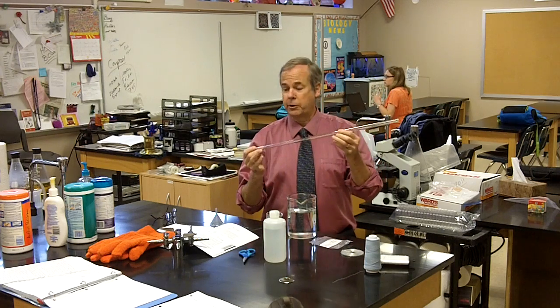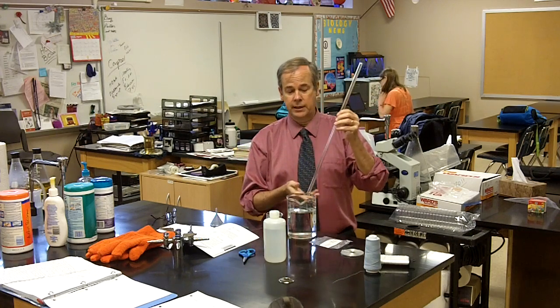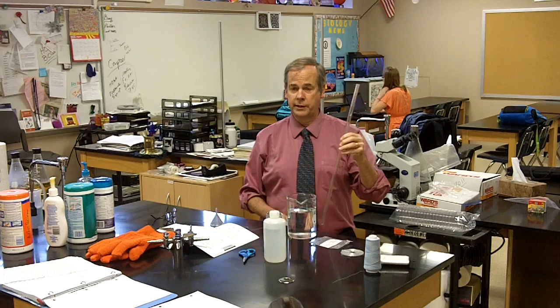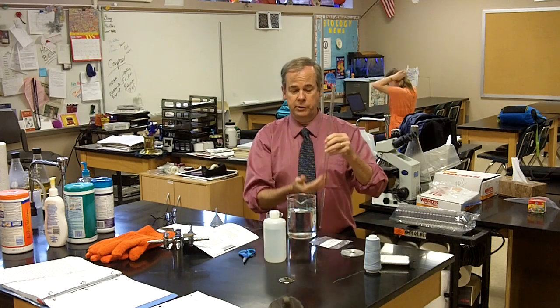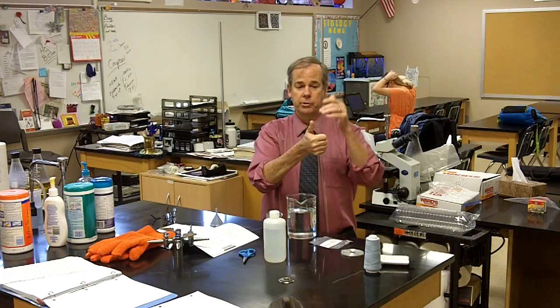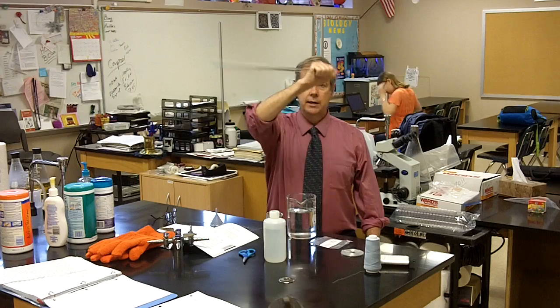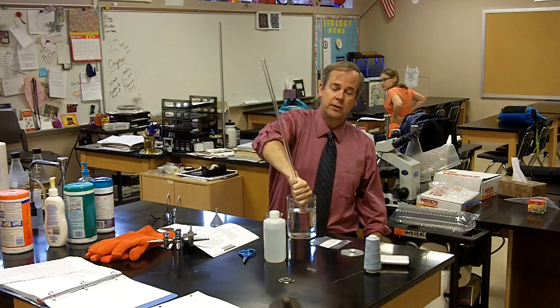Now we're going to use a eudiometer, a gas forming tube that is closed at one end, open at the other. We're going to fill it with liquid, place our magnesium inside, invert it and place it in water.